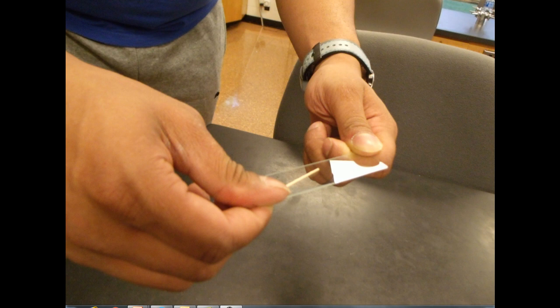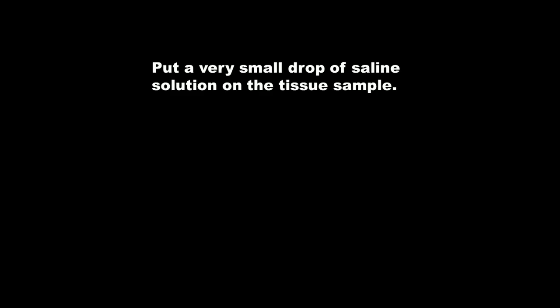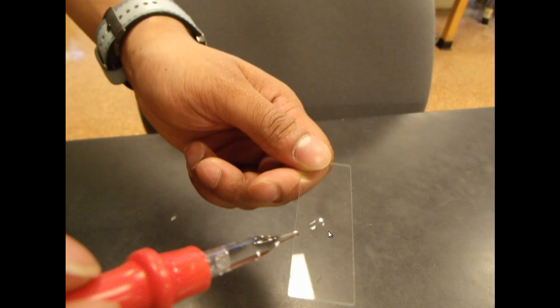You're going to place the sample by scraping it gently onto the slide. He'll now put a very small drop of saline solution on the tissue sample like this, just a tiny amount.